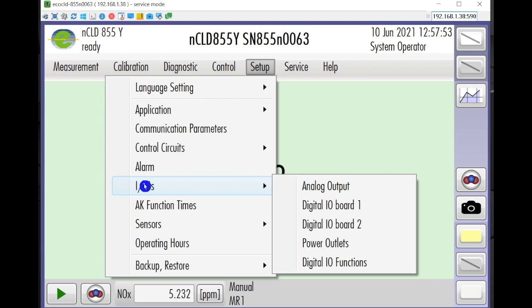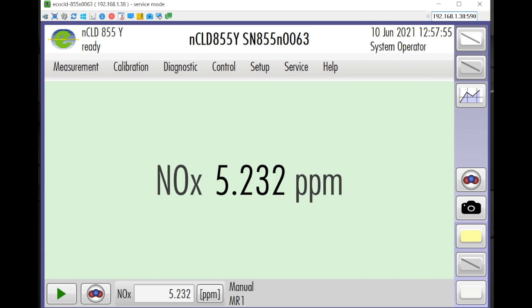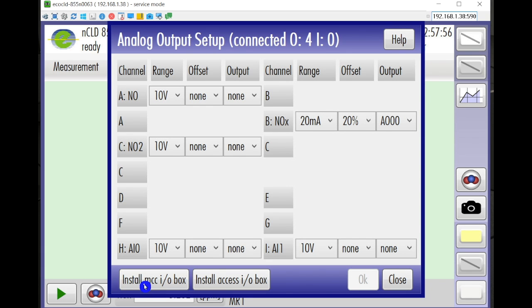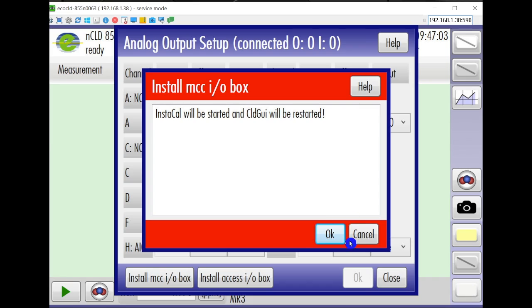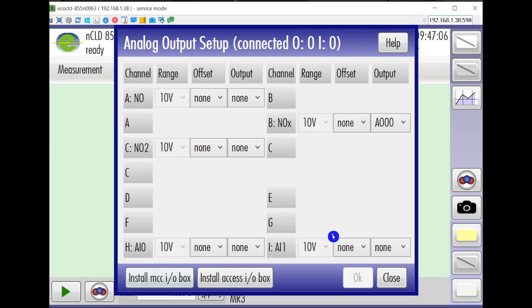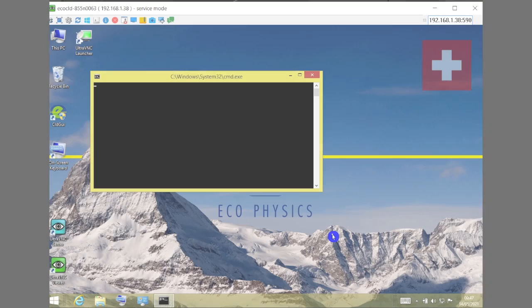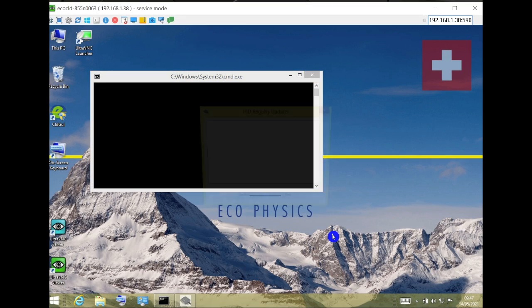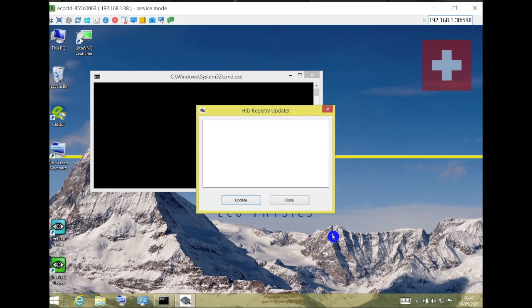The analog output setup window comes up. You will see the install tab for the IO box on the lower left corner of this window. Click on this tab and click OK to the warning message that follows.